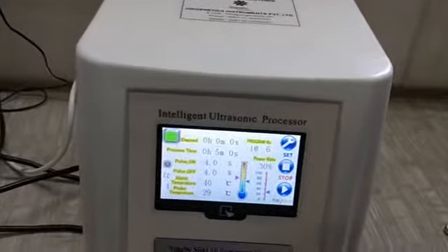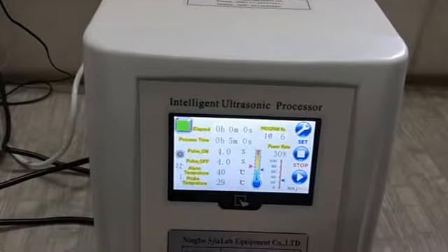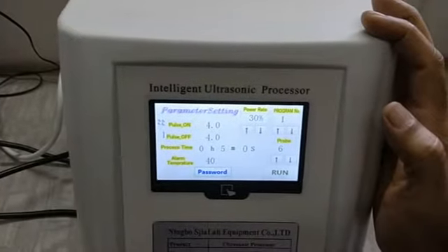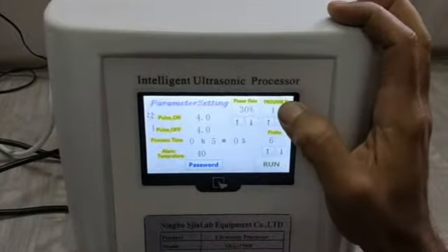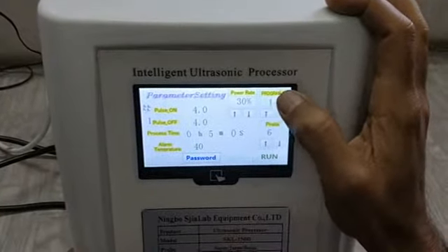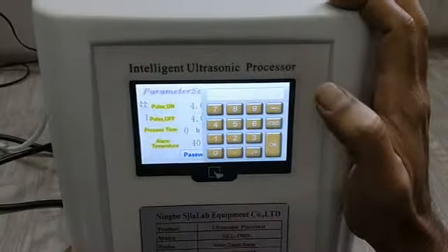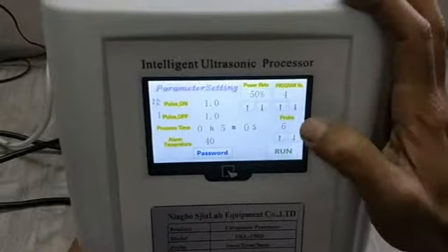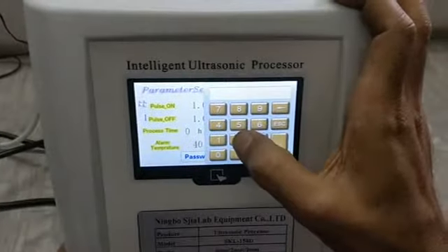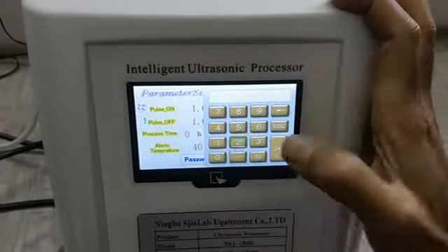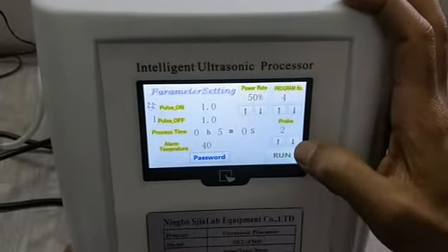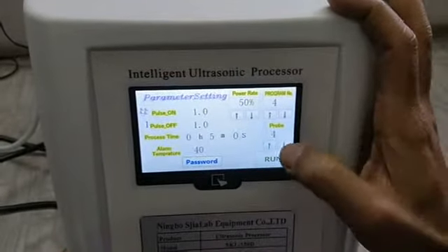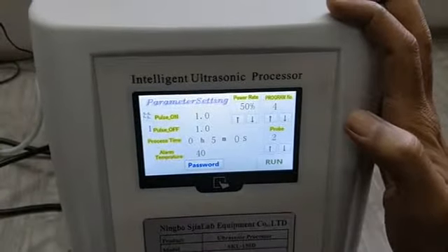Suppose I want to set my program number 1. I will go to set. Then I will firstly select my program number. Suppose I want to save this as number 4. I will save 4, okay. Then I will select my probe. My probe is 2, okay. Or I can select my probe by increasing or decreasing: 3, 4, 3, 2.